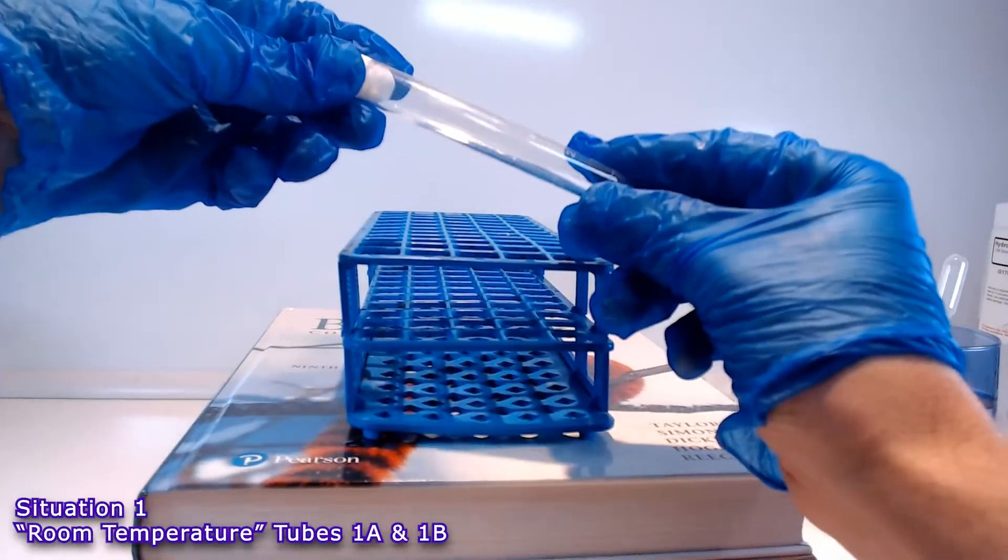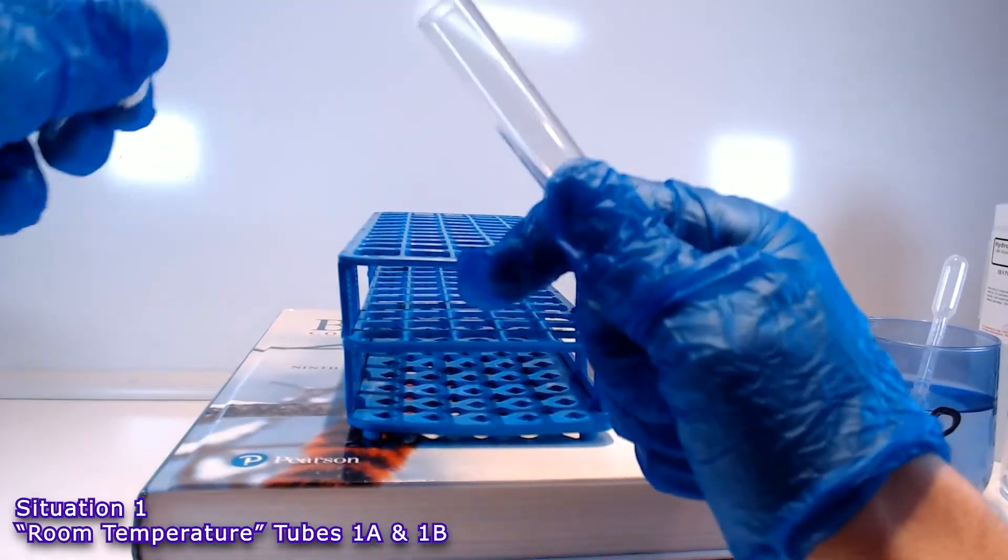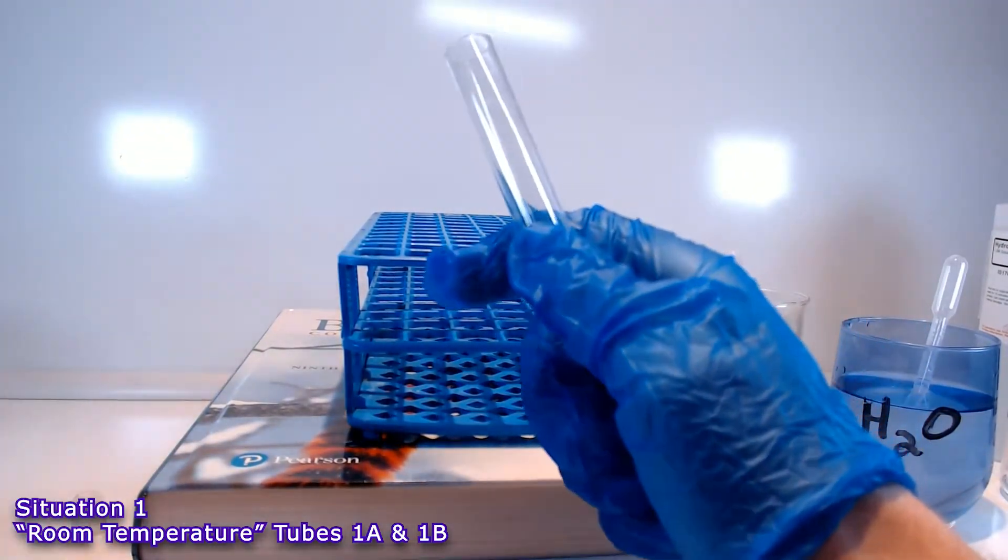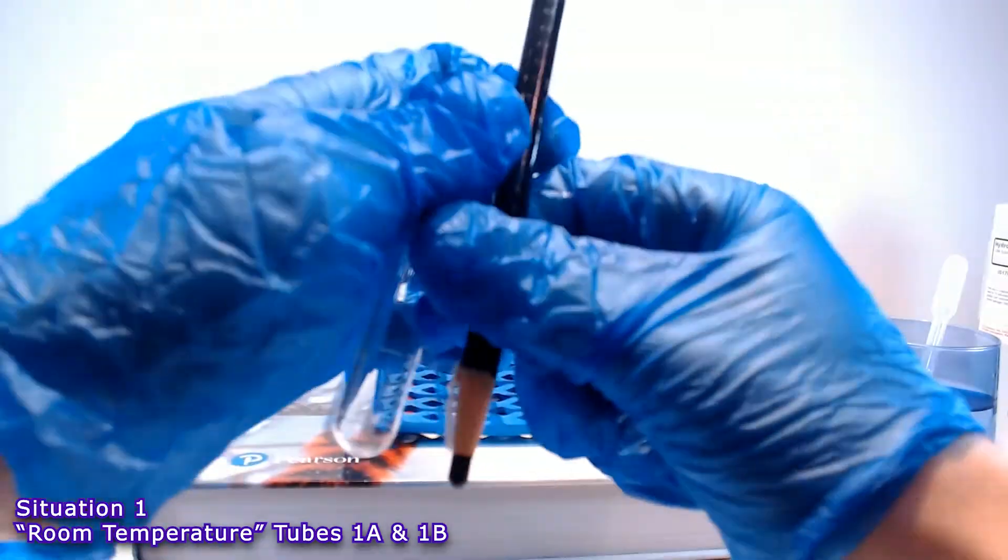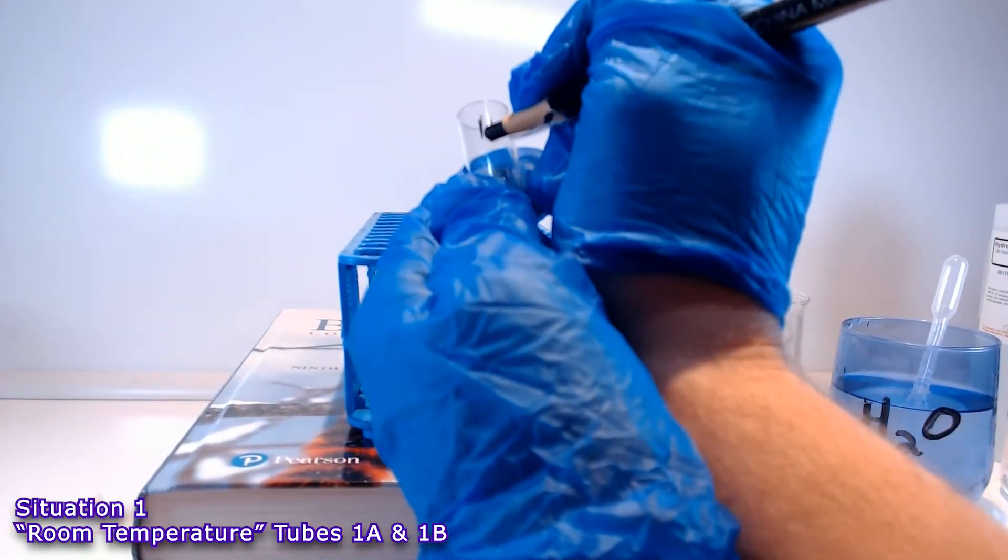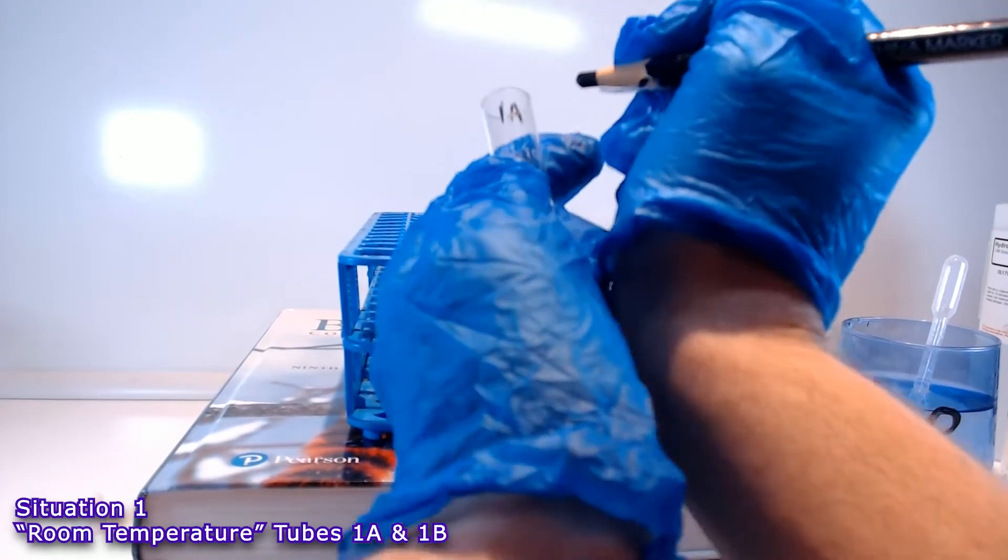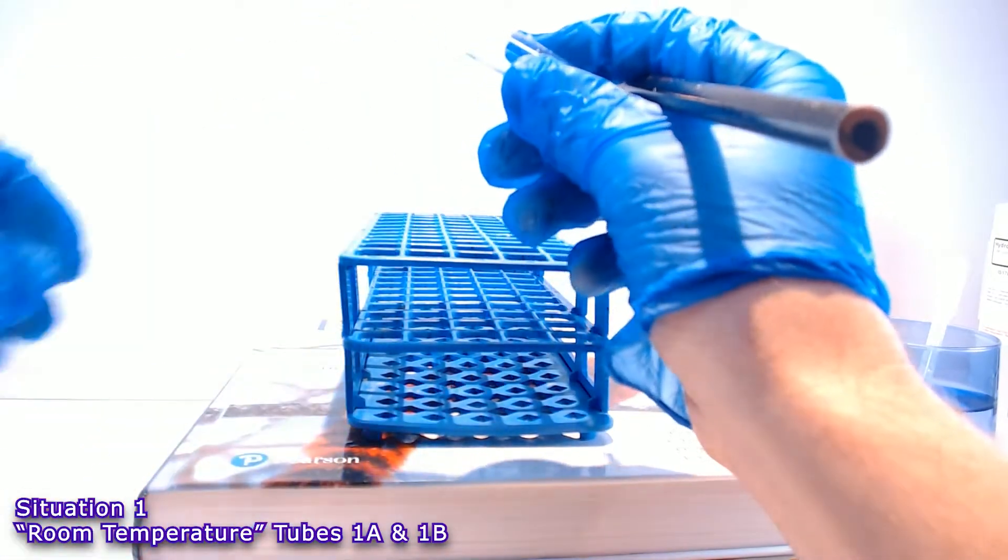In the instructions for situation one, it tells us to take a test tube and make a mark one centimeter from the bottom, then make a second mark two centimeters from the bottom. We're going to do this with a second tube, and we're going to label them tubes 1A and 1B.